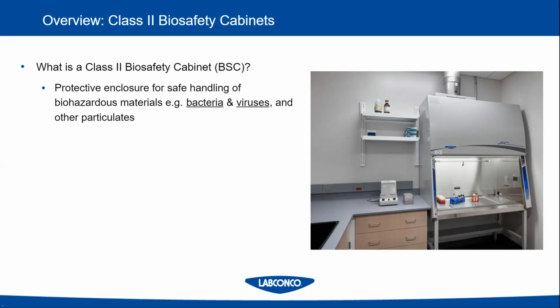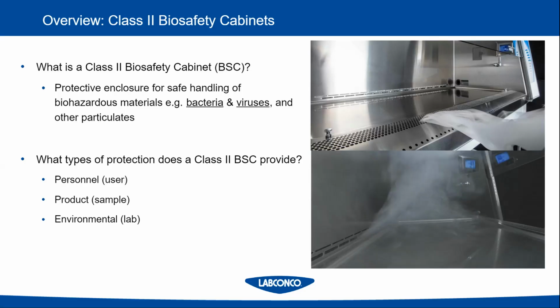What are the parts of a Class 2 biosafety cabinet? First of all, the purpose is to provide an enclosure for the safe handling of biohazardous materials like bacteria and viruses.